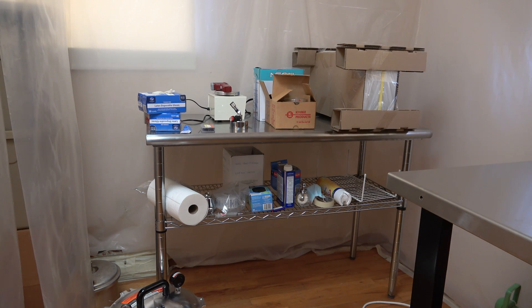Hi everyone. It's been a few weeks since I've put up a video because I've been shopping around and getting supplies together to improve the sterility and efficiency of my home laboratory setup. I was having problems with mold spores getting into my agar causing issues with monocultures, and possibly getting lower yields and some instability, so improving my lab setup will cut out any of those factors that might be getting in the way.